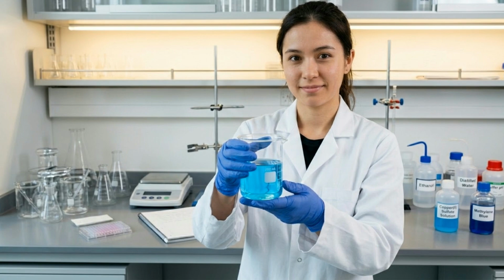This is a beaker, and it is used for holding different volumes of liquids, more than a test tube. It is available in various volumes, such as 100 millilitres, 50 millilitres, 200 millilitres, and so on. It can be made of glass or plastic.